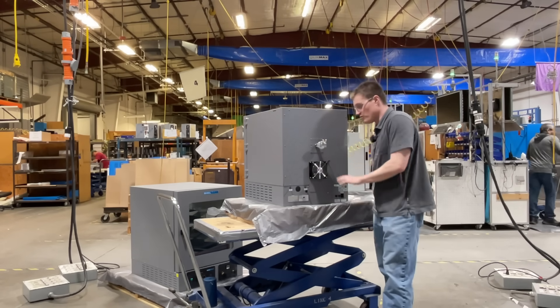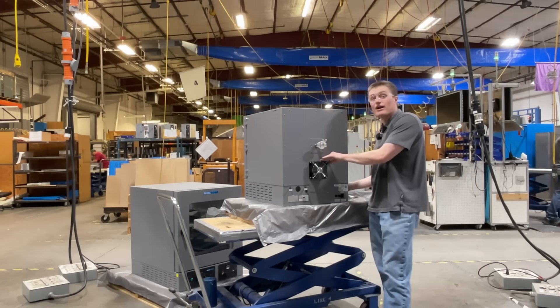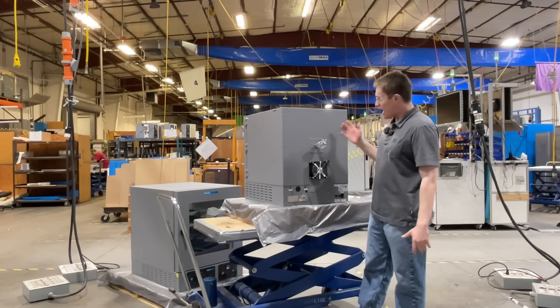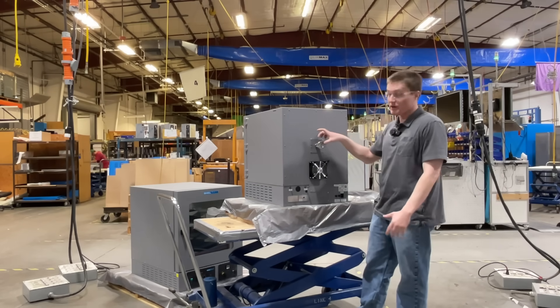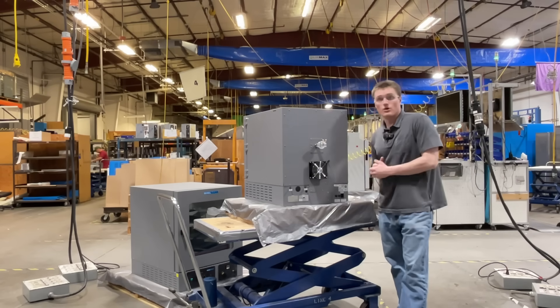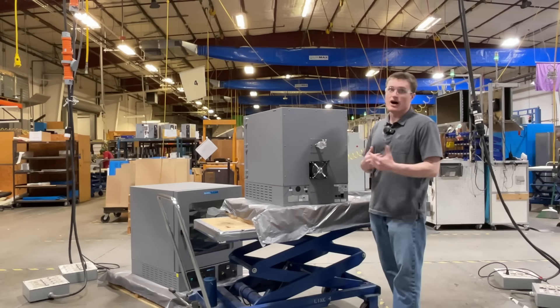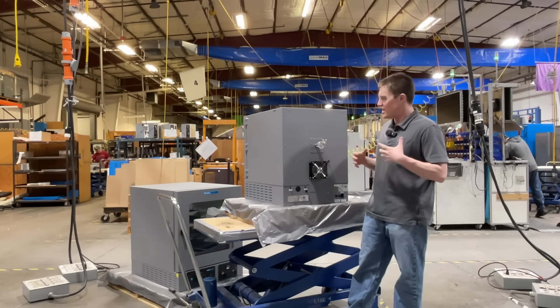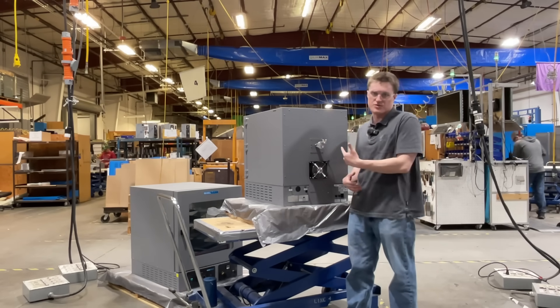Additionally, you will find a fan that's used to circulate air for the electronic components of the unit to help keep them cool. And lastly, you'll find a KF25 flange that you are able to mount anything you want to it. Many of our customers like to use cable pass-throughs as well as additional data logging functions through this port.